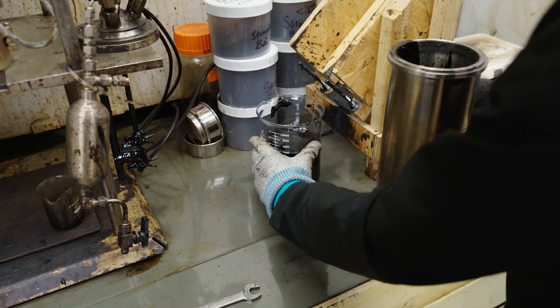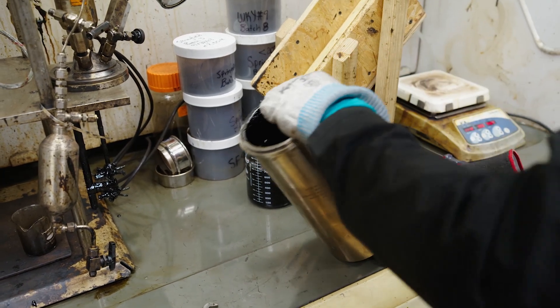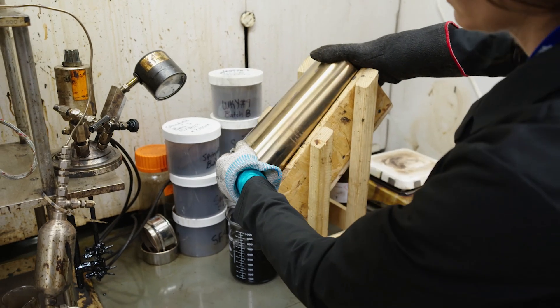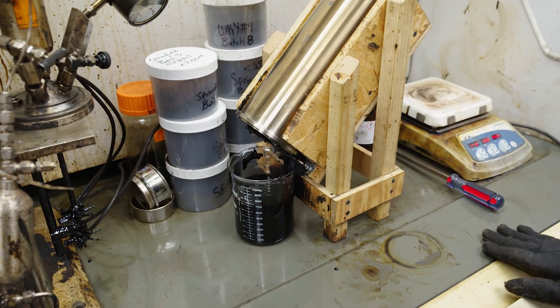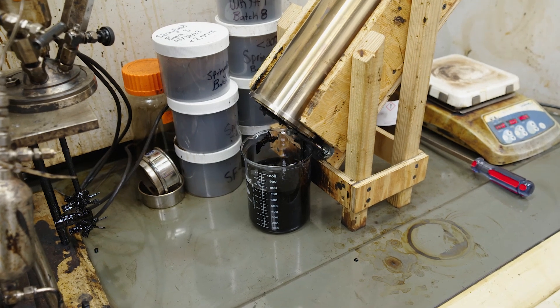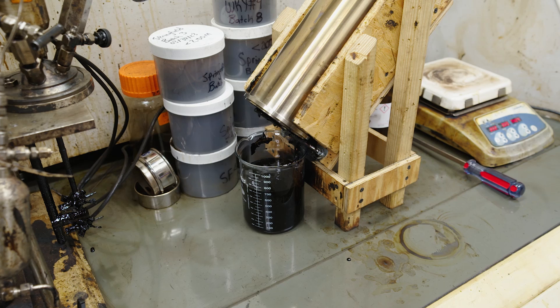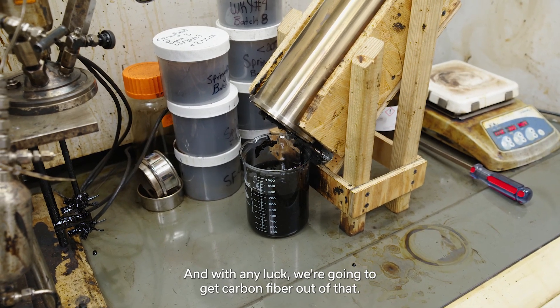And with any luck, we're going to get carbon fiber out of that.